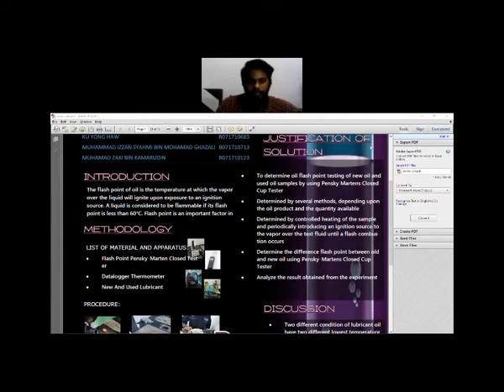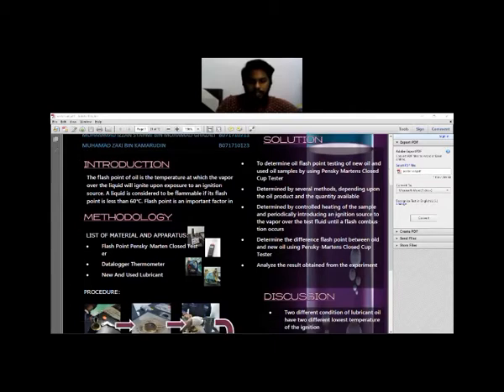Lastly, therefore, if used, we should consider it in defining routine tests for all used oil analysis programs, and it should definitely be among several strategic exception tests to confirm and diagnose potential nonconforming conditions flagged by routine tests such as viscosity and infrared spectroscopy.